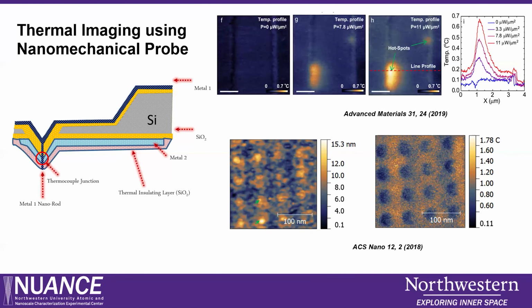The whole idea is that you can use the simple concept of AFM cantilever probe interaction, but with a certain modification of the hardware and software, you can do multiple other techniques and quantify those properties, whether mechanical, electrical, or chemical. In this case, in normal thermal microscopes, we use two wires that make a thermocouple and measure the thermal conductivity, with a resolution down to a few microns.